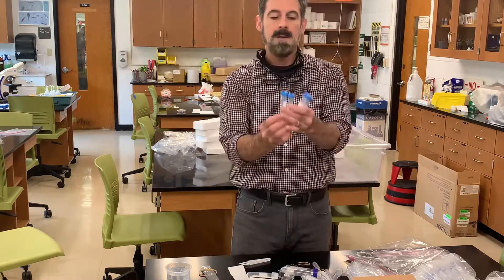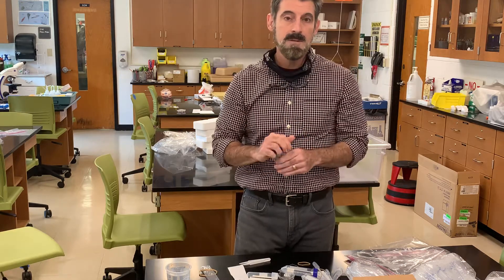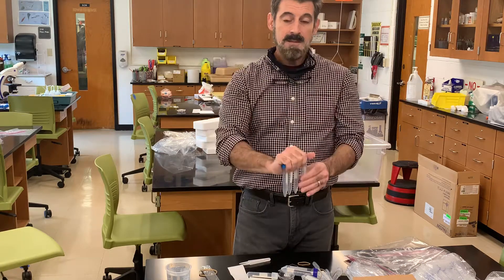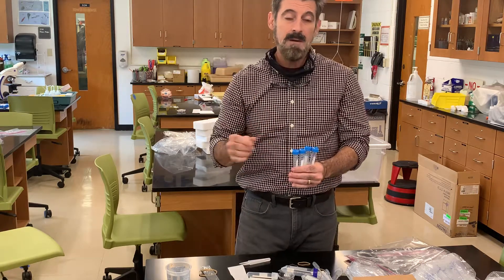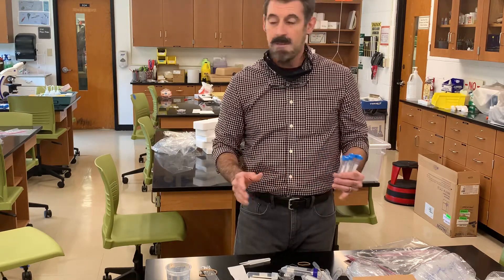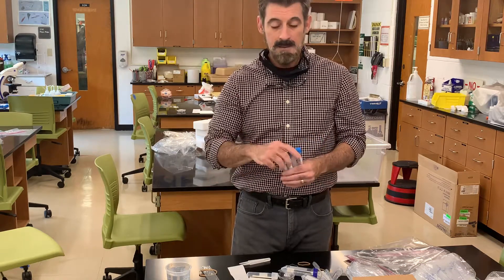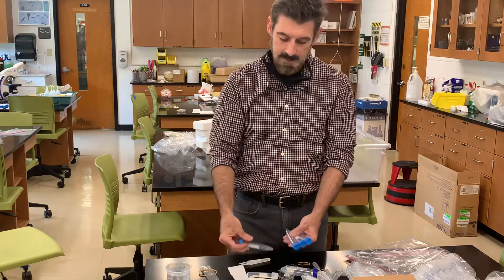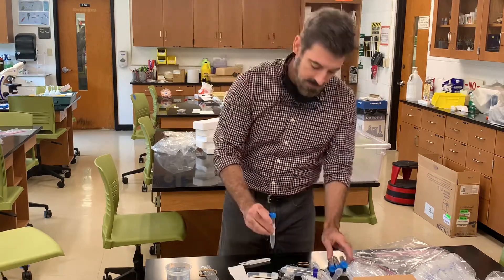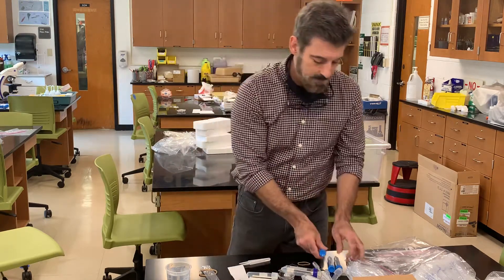You're going to have a number of small plastic centrifuge tubes that are also graduated. They'll be used in a serial dilution lab. You'll also need a test tube rack — in a separate video I'll show you how to quickly make one from a piece of cardboard. You'll fold it, cut it, cut little holes in it, and then hold the tubes upright in it. Otherwise they'll sit sideways on the table, making it difficult to add liquids while holding other things.